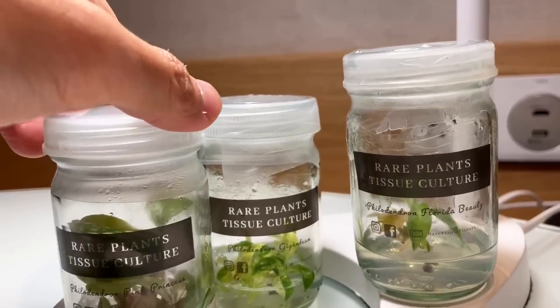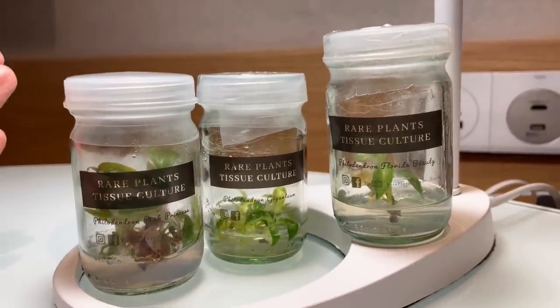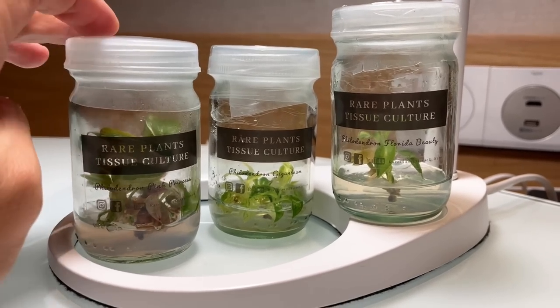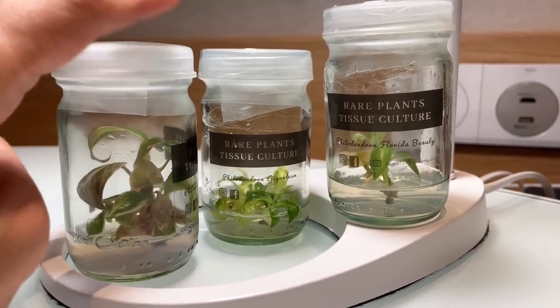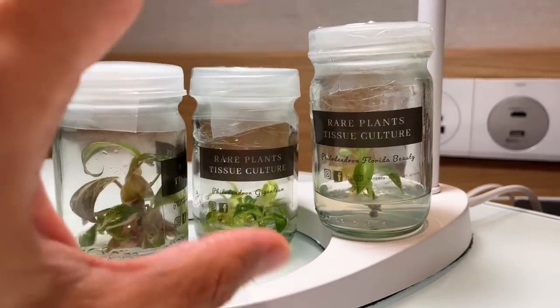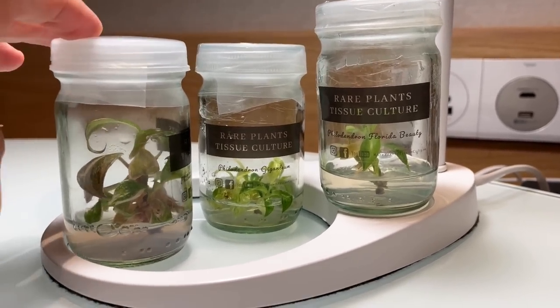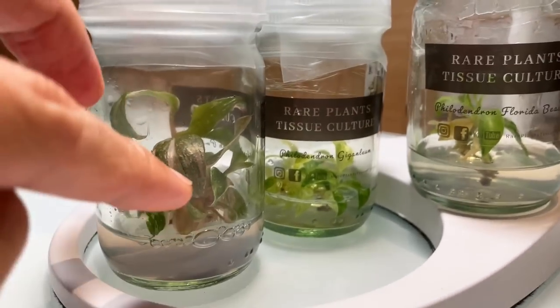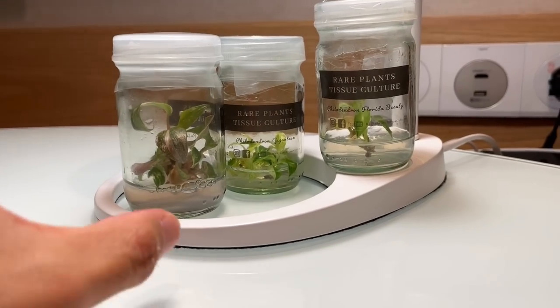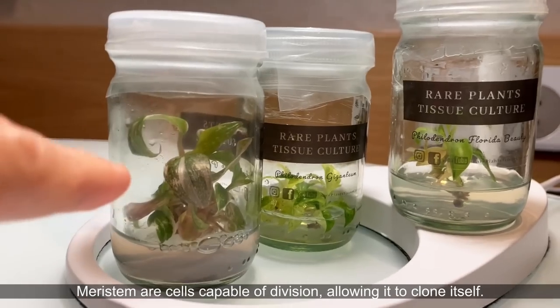The process of multiplying them is not as fast and easy as I originally thought. You need the mother plant, and sometimes the first time you do it is wrong. You may have to sacrifice many mother plants and many months until you get the formula and technique correct. Then from then on, you produce these, and they will produce babies. The original node will keep producing babies as well. Once you remove it and keep it in the solution, the meristems will keep producing baby plants.